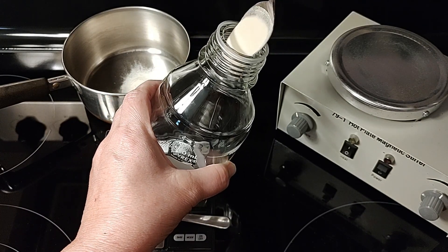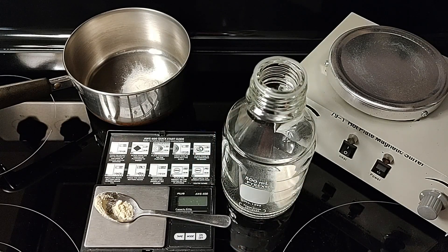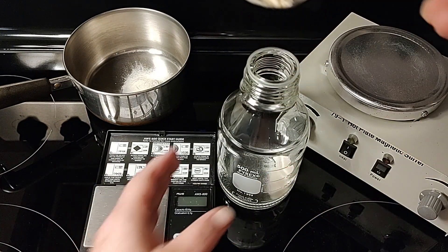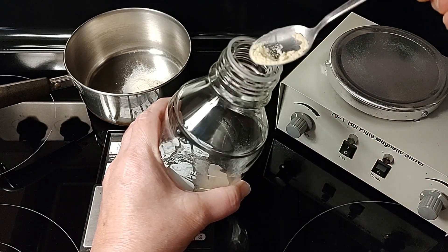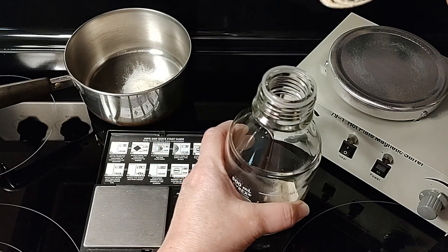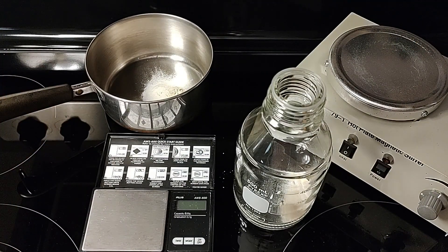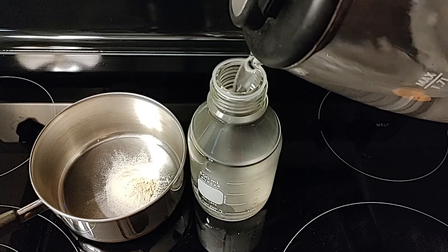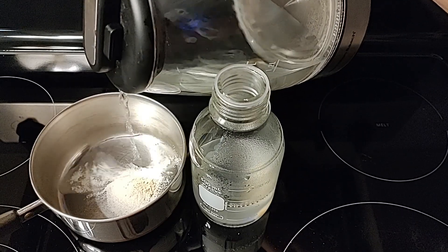We like to use three different plates whether we're cloning or transferring: water agar, which is just water and agar; MEA; and MYA with nutritional yeast. I put the agar in first and now I'm putting in the malt barley extract. I just want to show you putting in your dry ingredients first and keeping it all dry. On the bottle, make sure you don't get any dry ingredients around the mouth of the bottle, because when you add the boiling hot water you'll see condensation and any ingredients there would start congealing and getting sticky.